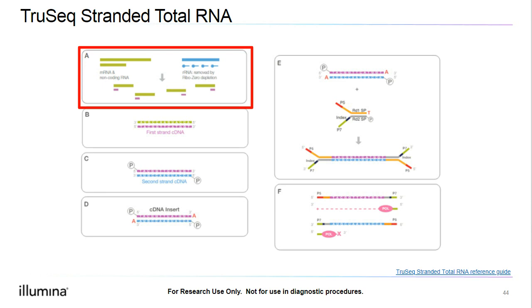Ribosomal RNA can be abundant in a sample, and it doesn't really provide much more information for sequencing. So we deplete our rRNA by using sequence-specific probes against our rRNA. After our rRNA depletion, we do not perform a poly-A step. We proceed with fragmentation, cDNA synthesis that keeps strand information, A-tailing, index adapter ligation, and library amplification. Note here that the fragmentation step can be modified for FFPE samples that are expected to be more fragmented.